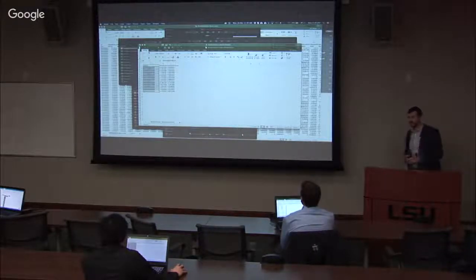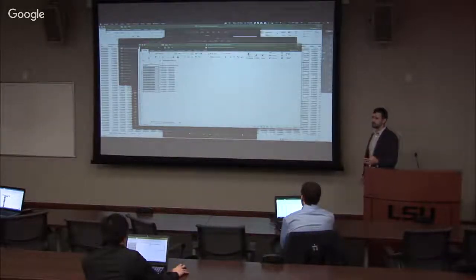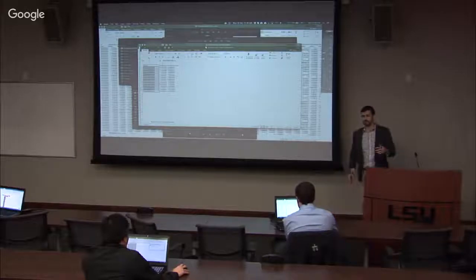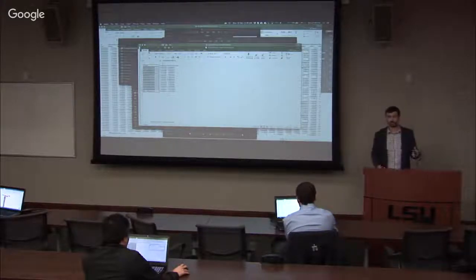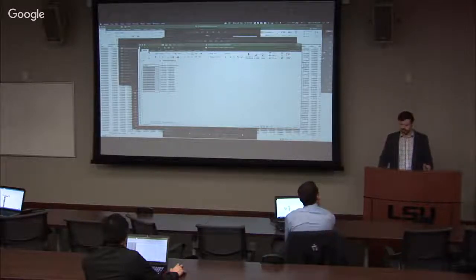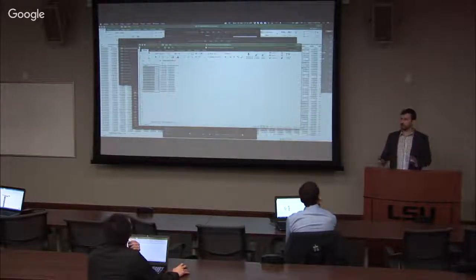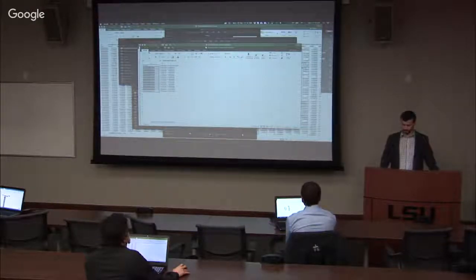And there, I just have to tell you, this is beyond the scope of this workshop, but when you deal with expression values and separation between genes, you probably want to use a different measurement of distance based on density. And so we have a few methods here that do density-based clustering instead of Euclidean distance. So that is the way that you can use these different methods. I just don't have a lot of time, so I'm going to skip over a few things.